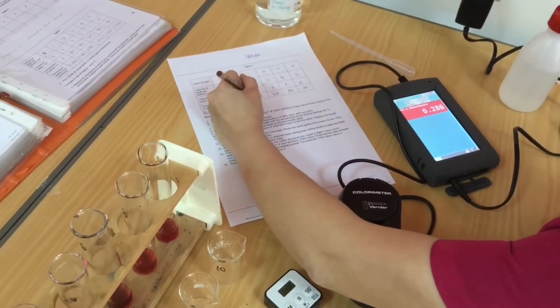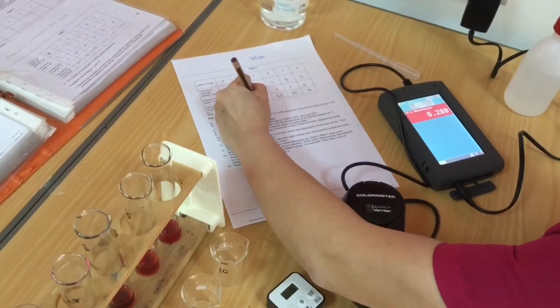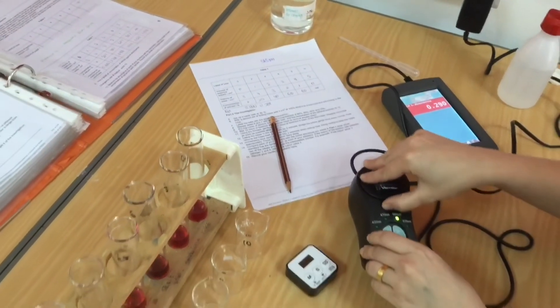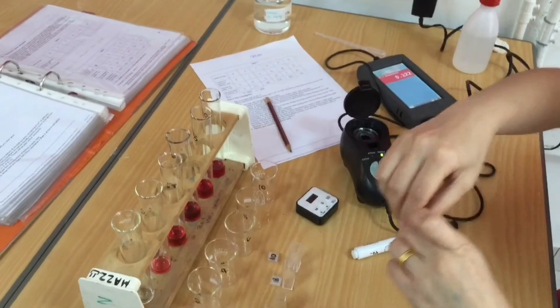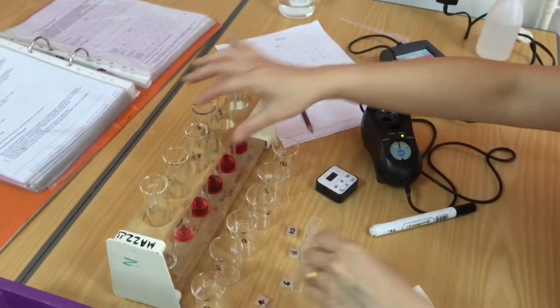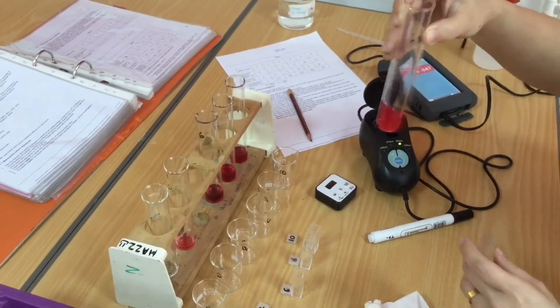So write that down, that's .286. Put that into the table. Then we just lift the lid to remove that and put it back in place so we can keep track of where we are.